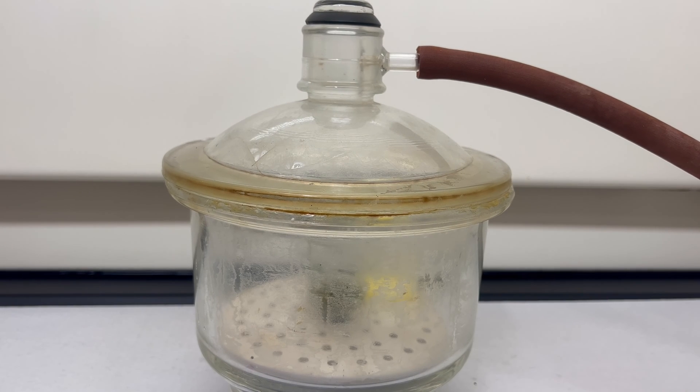Uranium halide compounds are very hygroscopic. Uranium tetrachloride being no exception. It should be kept in a desiccator or in a glove box for storage. Moisture will react with the compound forming hydrated oxychlorides, defeating the whole purpose of all these steps.